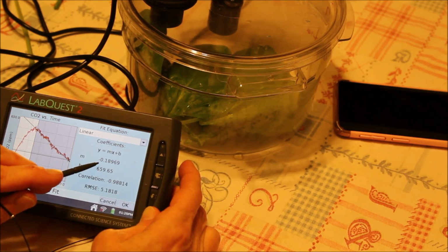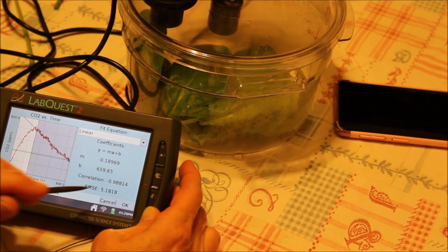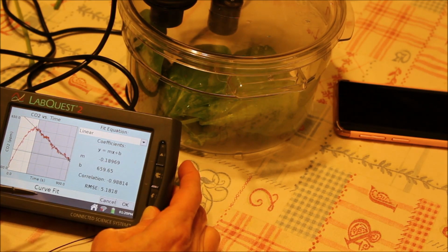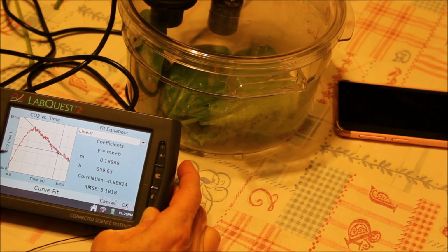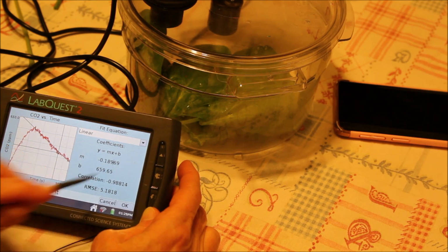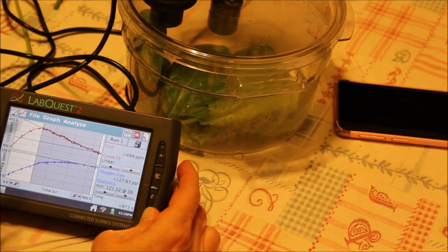So you write it down in your notebook: minus 0.18969. That means the rate of carbon dioxide usage by the plant because of photosynthesis. And that means this is how many parts per million carbon dioxide is used up per second. That's really the rate. You go back to the main screen by clicking OK.